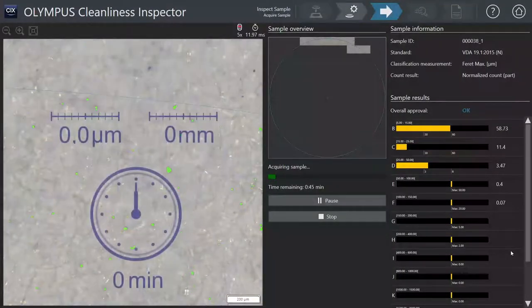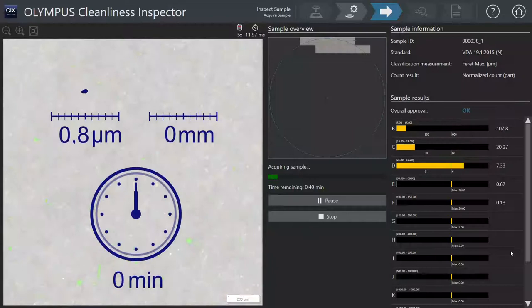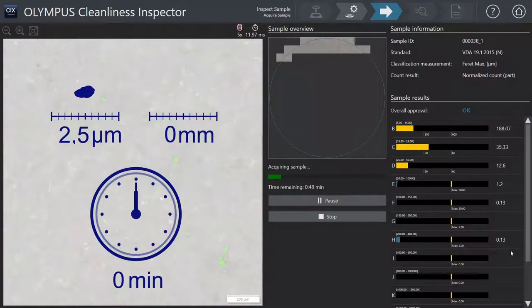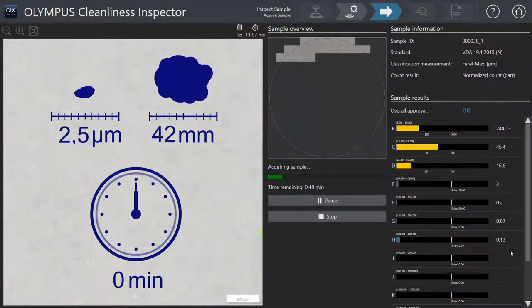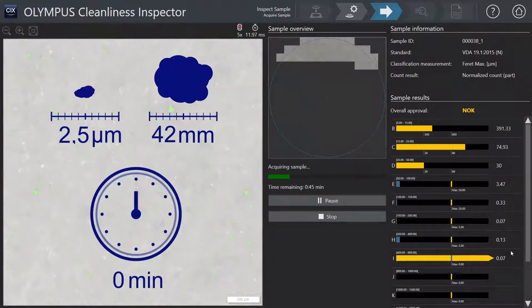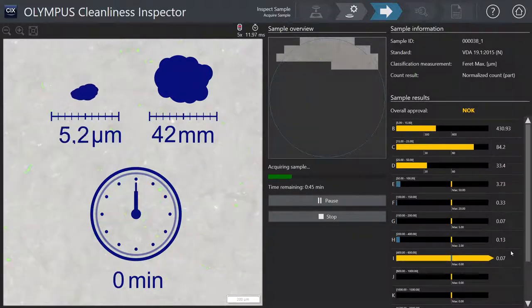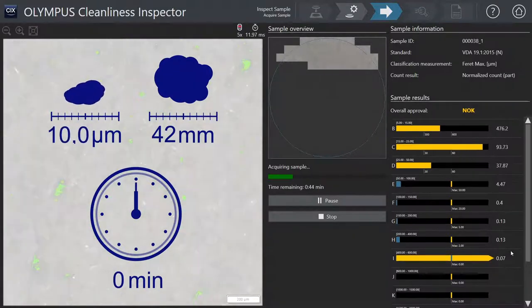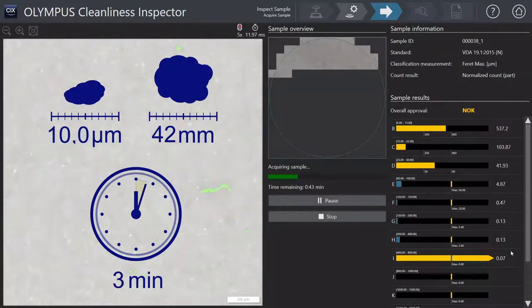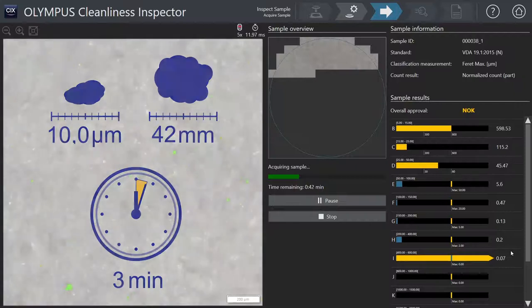A complete analysis of particles between 2.5 micrometers and 42 millimeters is conducted in 10 minutes. For a contamination analysis down to 10 micrometer particles, less than 3 minutes is enough.